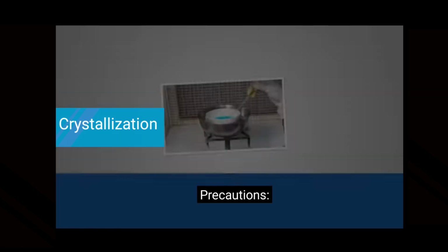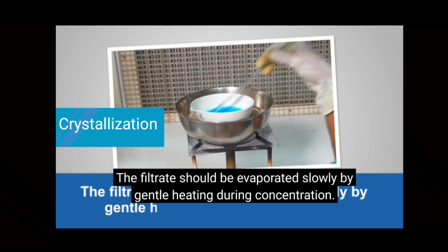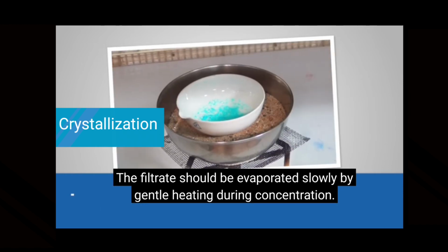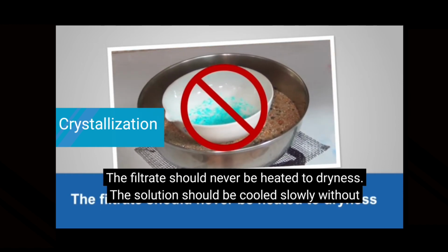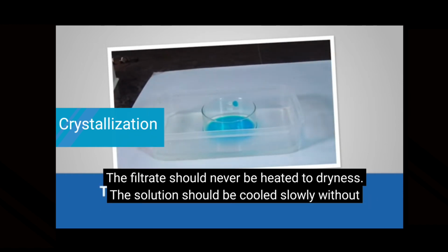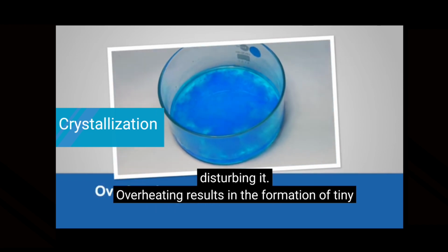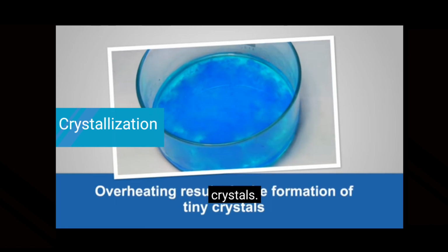Precautions. The filtrate should be evaporated slowly by gently heating during concentration. The filtrate should never be heated to dryness. The solution should be cooled slowly without disturbing it. Overheating results in the formation of tiny crystals.